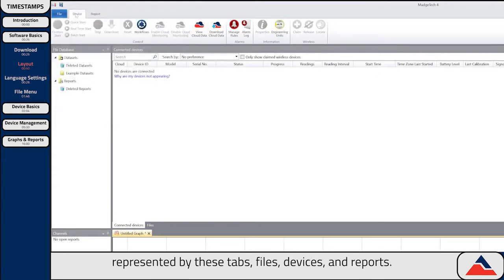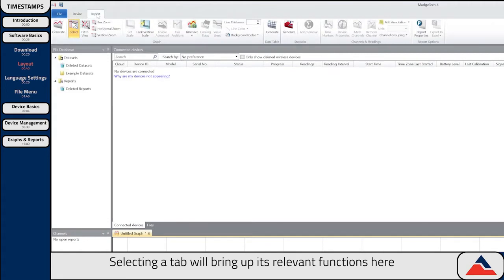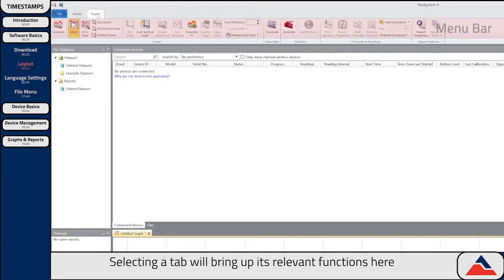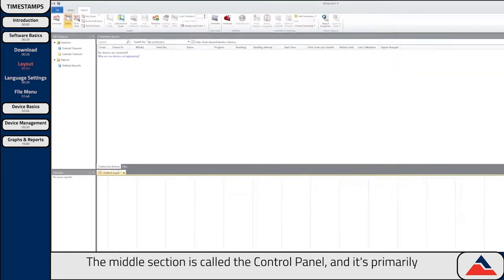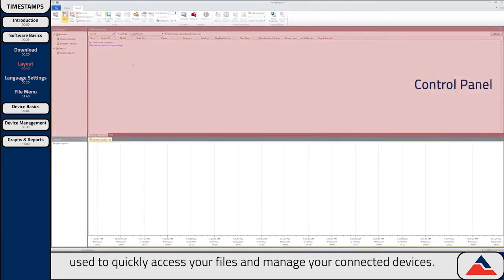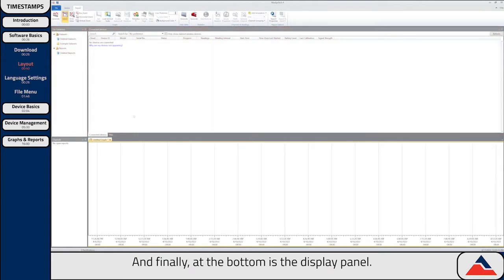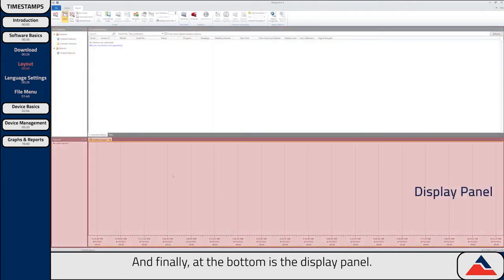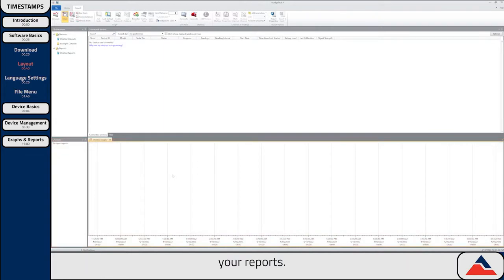The three tabs are Files, Devices, and Reports. Selecting a tab will bring up its relevant functions in what's called the menu bar. The middle section is called the control panel and is primarily used to quickly access your files and manage your connected devices. And finally at the bottom is the display panel. This section is used to view and manage your data, as well as customize your reports.